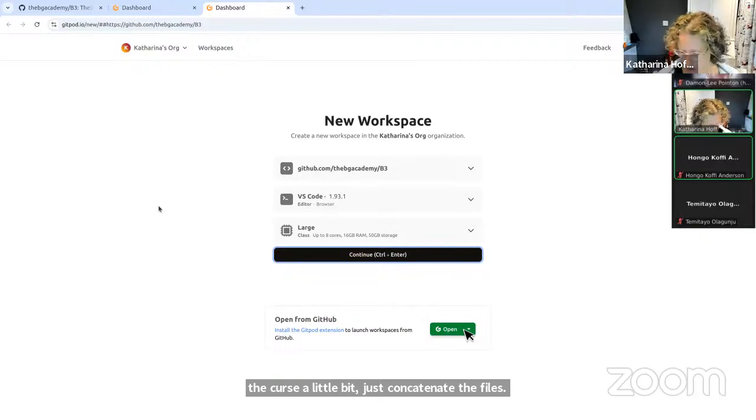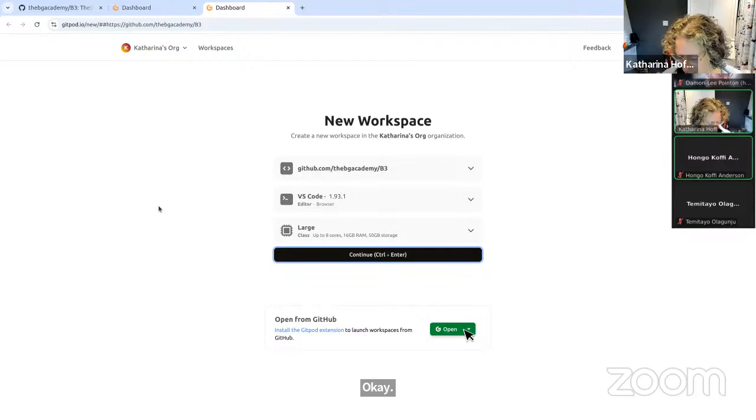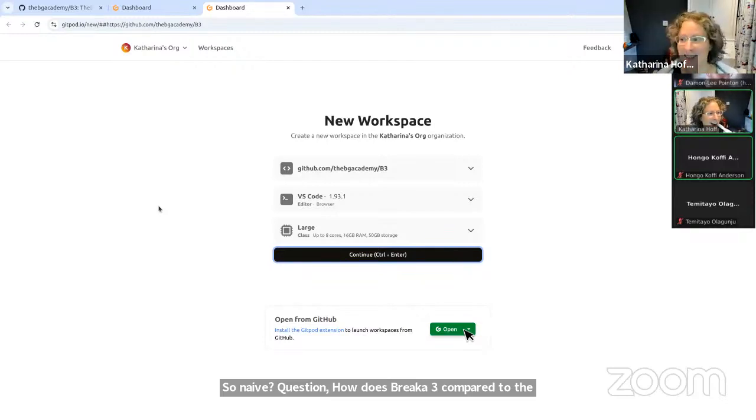So naive question. How does BRAKER3 compare to the GNOMON pipeline? Oh, wouldn't I wish to know? I really would like to know. The thing is that I cannot run the GNOMON pipeline. I tried to install it, believe me. I spent like 2 weeks on it.